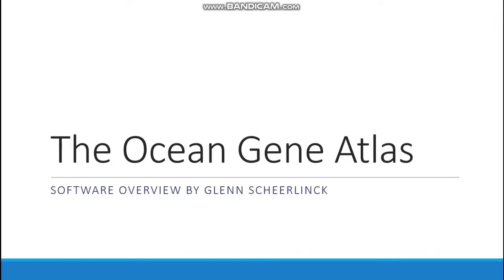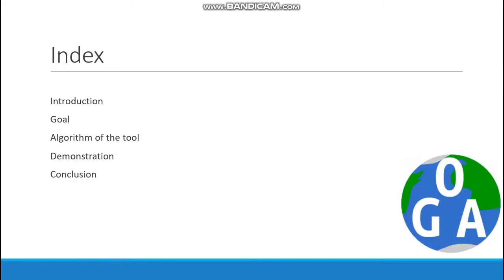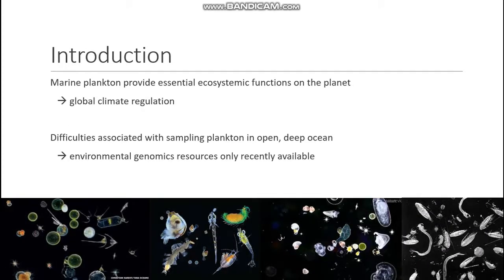Hello and welcome to this video where I will try and give an overview and demonstration about this web-based software called the Ocean Gene Atlas. I'll introduce the software and the main goal and why it can be used, followed by how it works. And I will give a demonstration on how to use the software with a clear example to then conclude it all. So let's start with a small introduction.